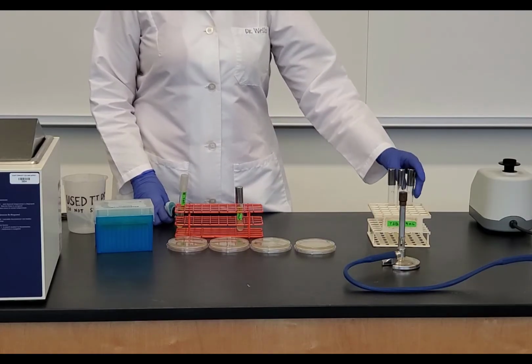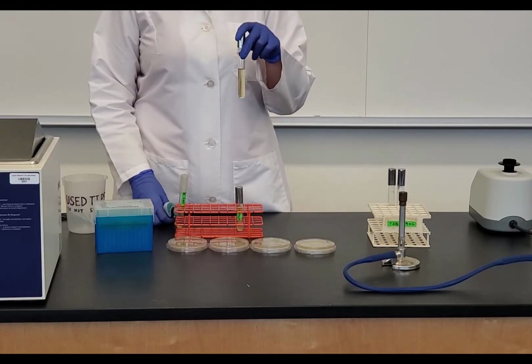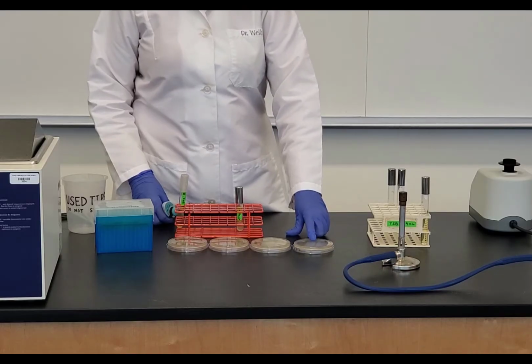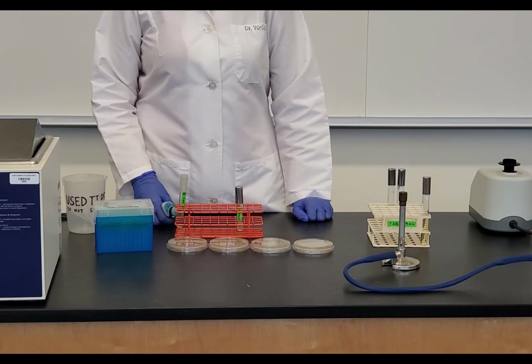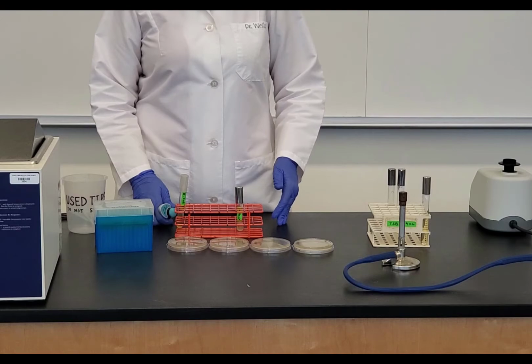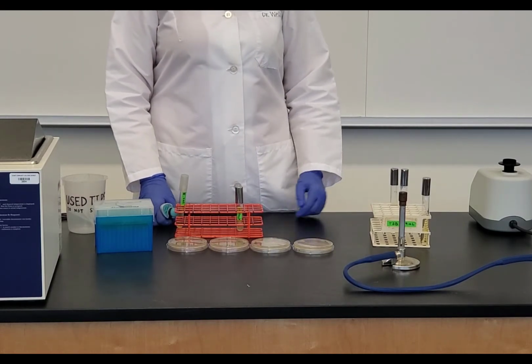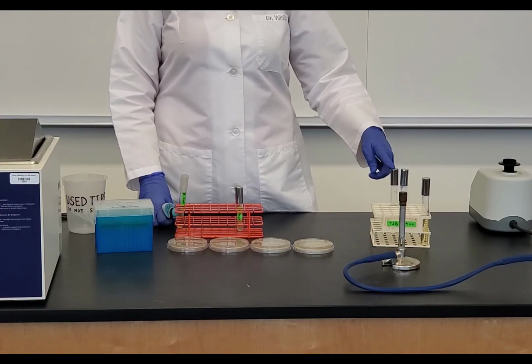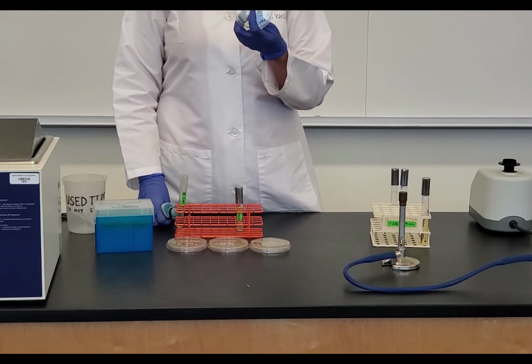So like my standard plate count, when I do this experiment, my 10 to the negative 2 is not going to be plated because my lowest dilution on my plate is 10 to the negative 4. So for your 10 to the negative 2, you can just move that off to the side. You don't need it. The only reason you needed it was to make your 10 to the negative 4 and then make your 10 to the negative 6. So my 10 to the negative 2, I'm just going to set aside. I don't need that. But I am going to need my 10 to the negative 4 and my 10 to the negative 6.